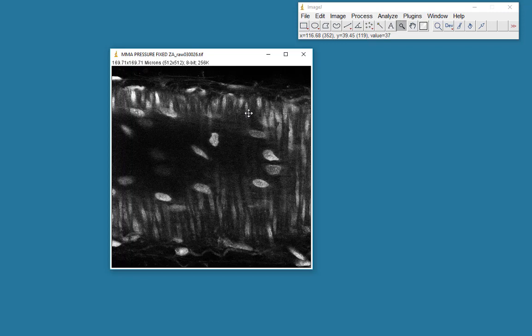And often with image analysis or image processing, we want to extract those numbers.